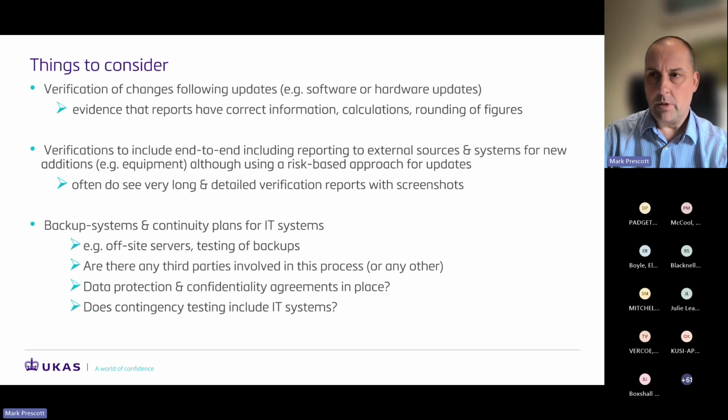Some other key things to look at now on the next couple of slides. So verification, one of our favourite subjects, of course. Any changes to your existing LIMS system need to be verified. So this may be software changes, or it could be hardware changes. It's really making sure that the reports have still got the correct information. Calculations are there. They're actually giving out the correct results. Any rounding up of figures, decimal places and things.